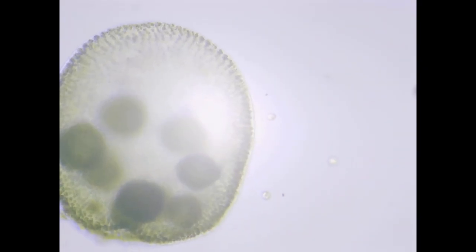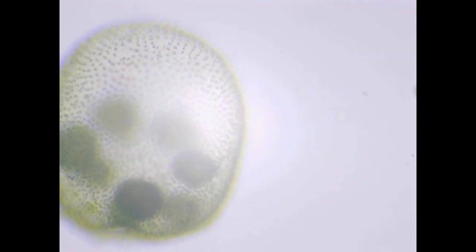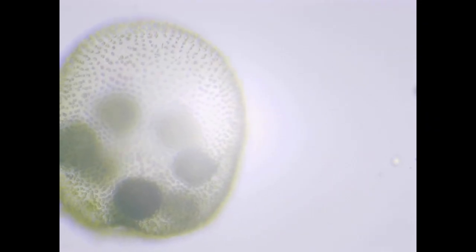Each cell has two flagella. Flagella beat in a coordinated way to roll the colony through water. This collective motion is an early form of cellular coordination.